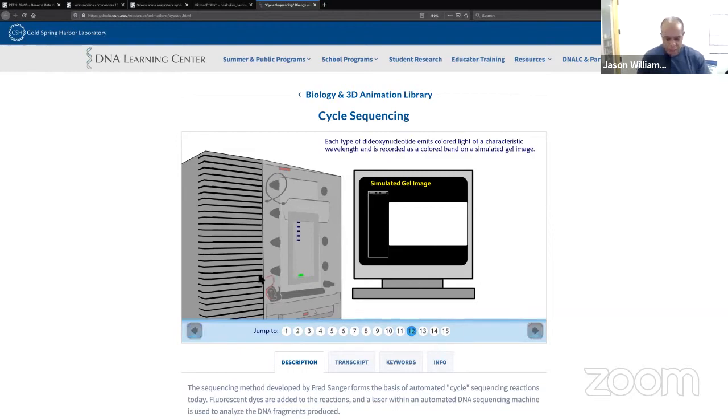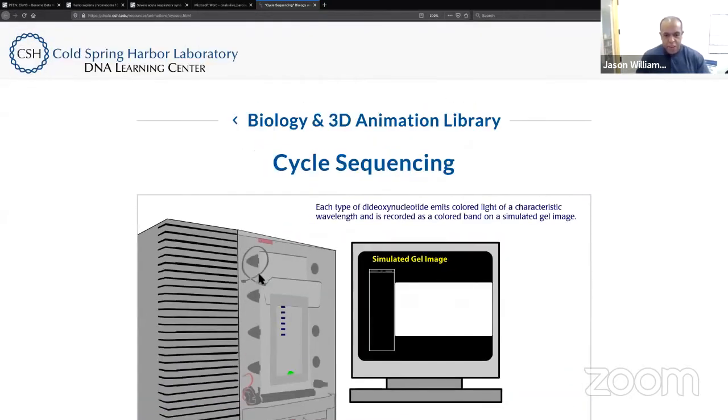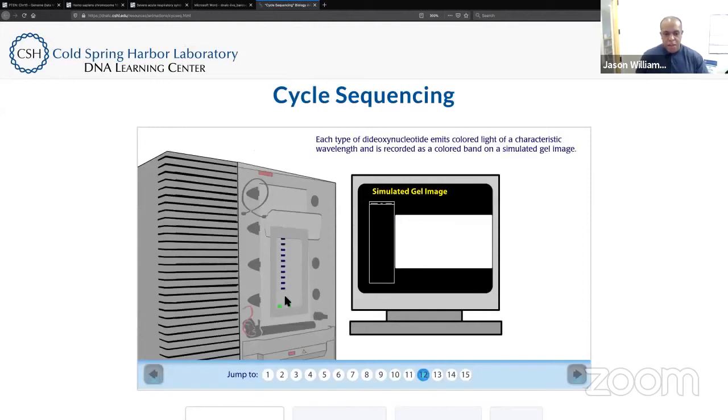You can kind of see them, I'm going to zoom in a little bit, as these little bands coming off the screen. And each one of those bands has a color that's read by a laser at the end. The cool thing about electrophoresis with polyacrylamide is that it's so thick that you can tell pieces of DNA apart, even if they only differ by one nucleotide.